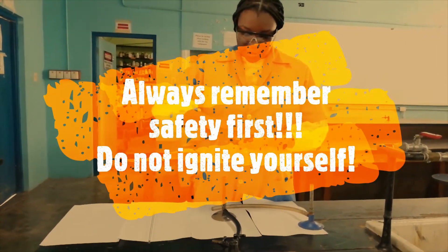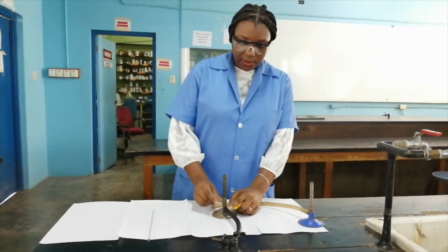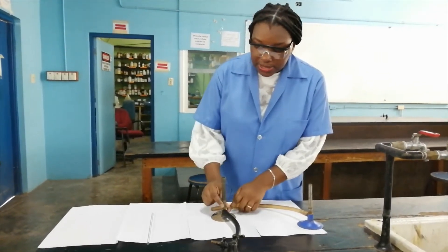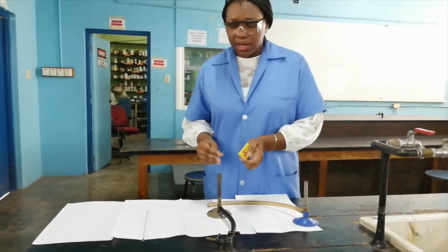We will now light the Bunsen burner. I am using a match and I am going to ensure that the air hole is closed. Why must the air hole be closed? You do not want the gas that you are trying to get up the barrel to light up here escaping through these open holes. So you have to close the air holes by turning the collar.